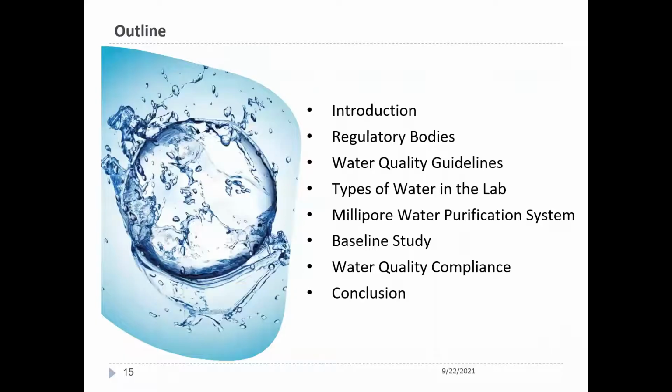This format. The introduction will look at regulatory bodies, water quality guidelines, the type of water in the lab, and the various types of Millipore water purification systems.